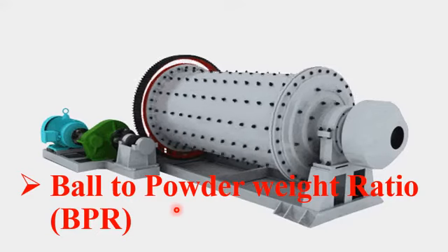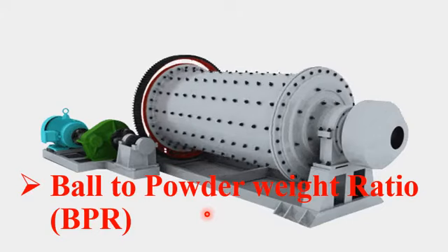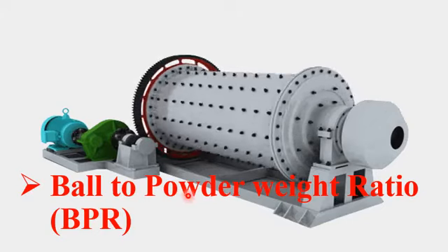Similarly, if the amount of the bulk powder is too much relative to the balls, then there is a possibility of decrease in the efficiency of the milling. So a lesser amount of the powder will be converted into crushed nanoparticles. There is also a possibility of increase in time and power consumption.